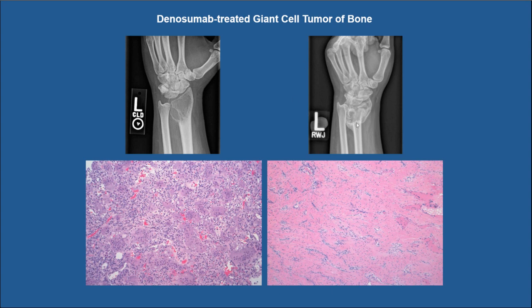The tumor became sclerotic inside, and the histological counterpart to that is that there is total disappearance of the giant cells. The mononuclear cells become attenuated and basically spindled and trapped between all these seams of woven bone or osteoid with focal mineralization.